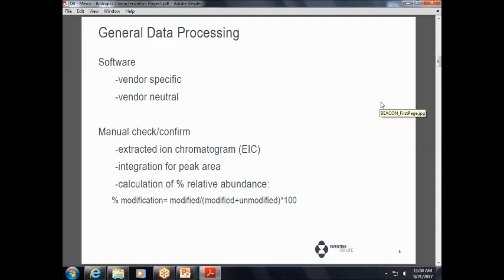And so the data processing, and so earlier we heard in the Framework 101 talk how much of the time, the majority of the time, is spent analyzing and cleaning up, digesting this data. And so how do we do that with our data processing? So it's usually in two steps, starting with software to help get an idea of what's going on with the molecule and using some manual steps to confirm and eliminate false IDs. So there's no standardized workflow in terms of how to process the data. And that's something that we would look to try to incorporate into our workflow.